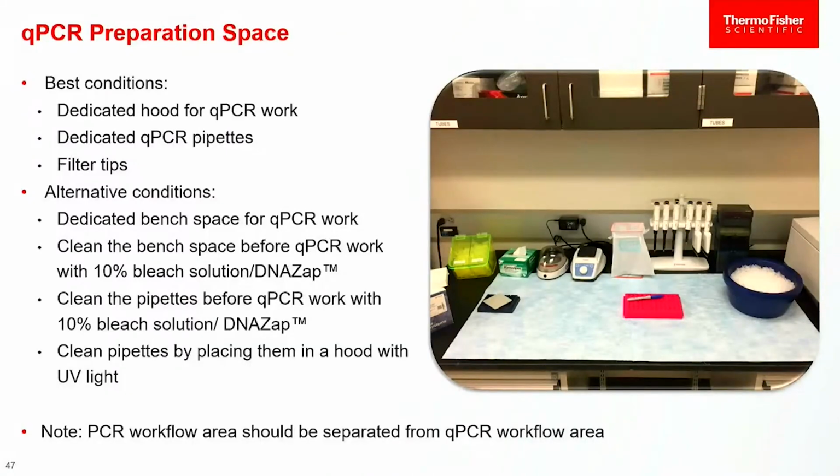Preparing your workspace. It's nice to be organized and set it up appropriately, and collect all your supplies before you start, like cooking, and your whole process is going to go better.